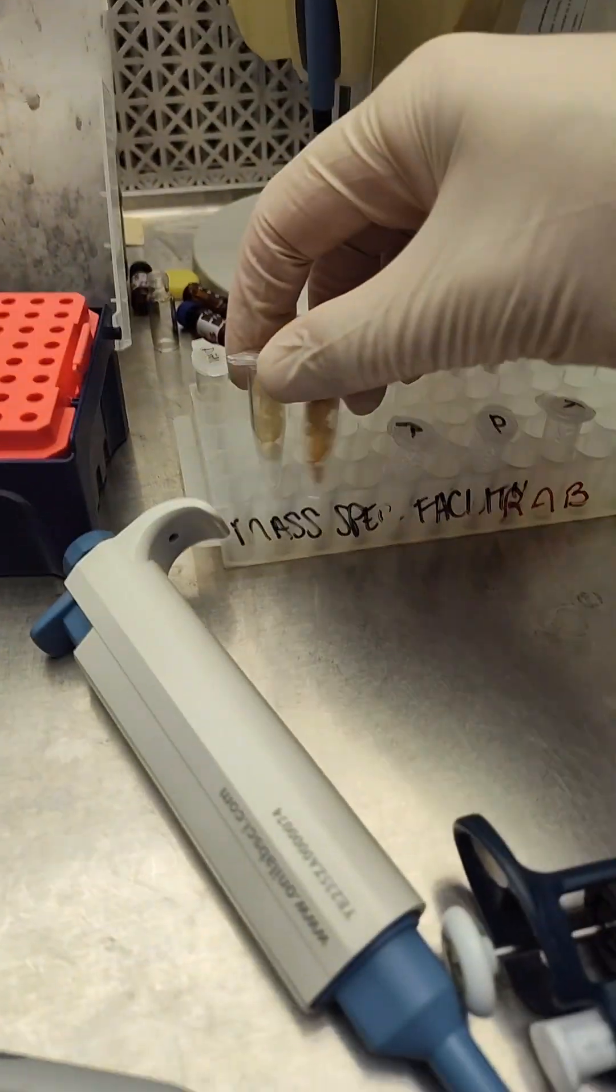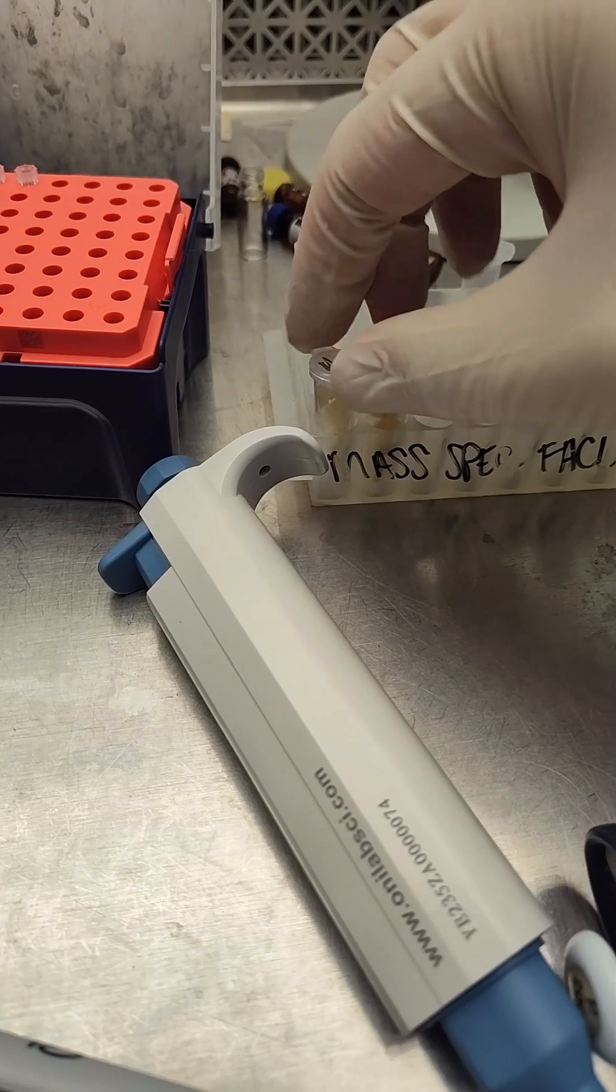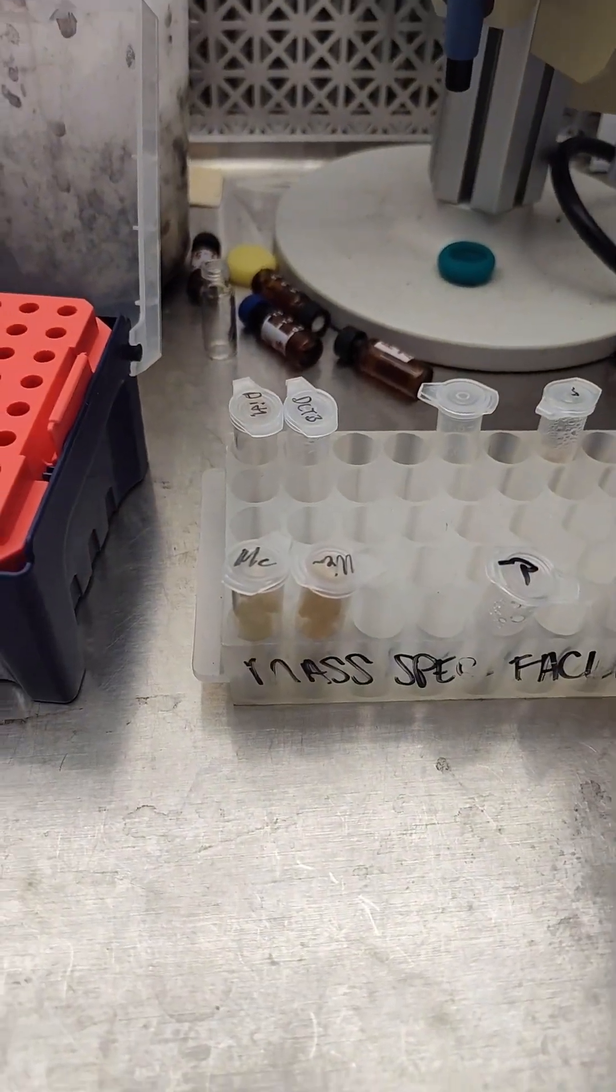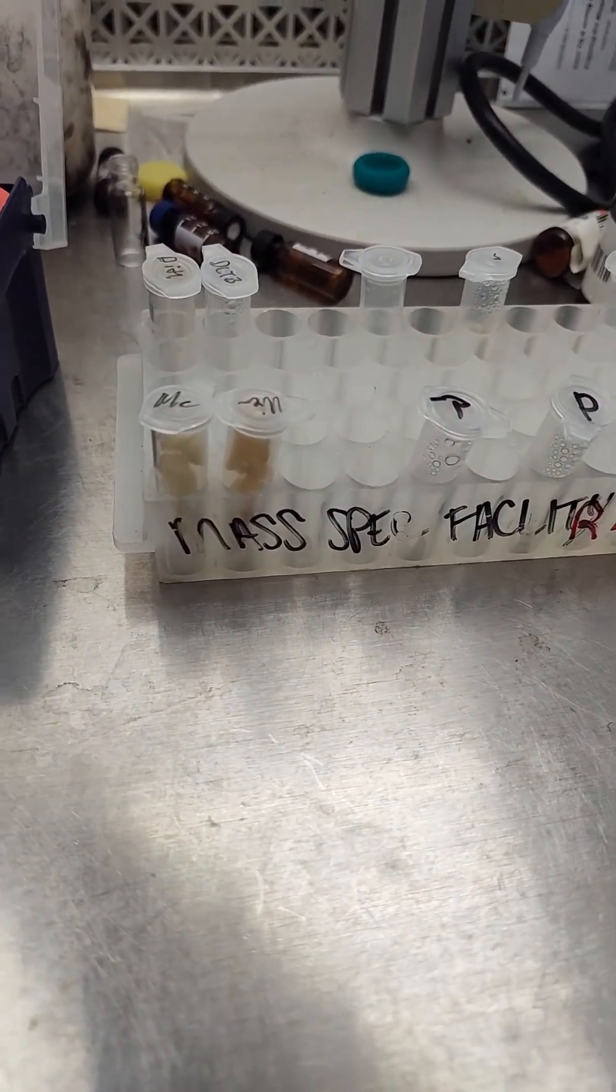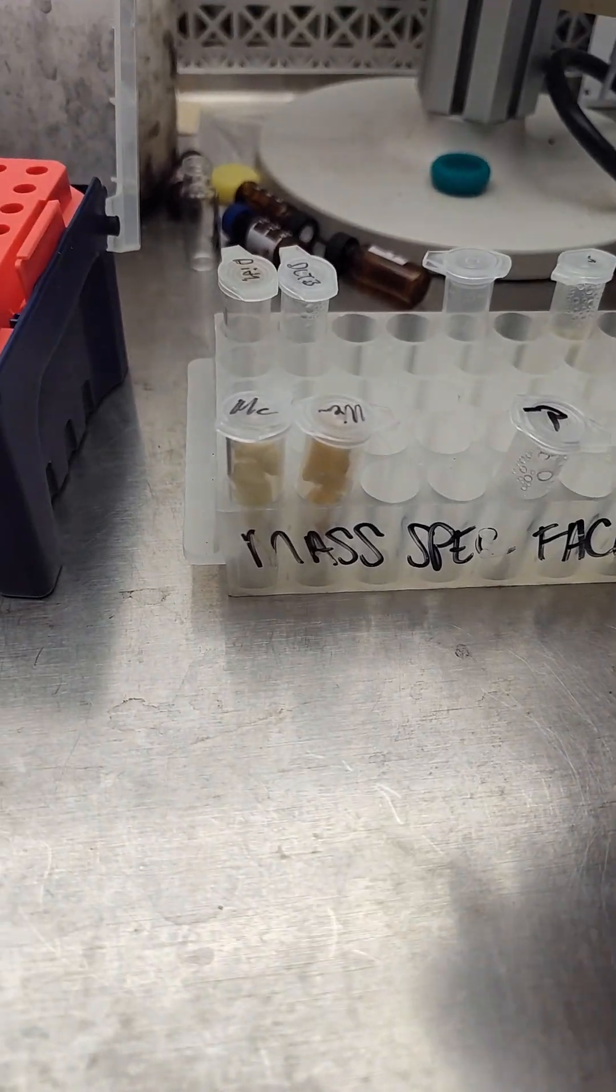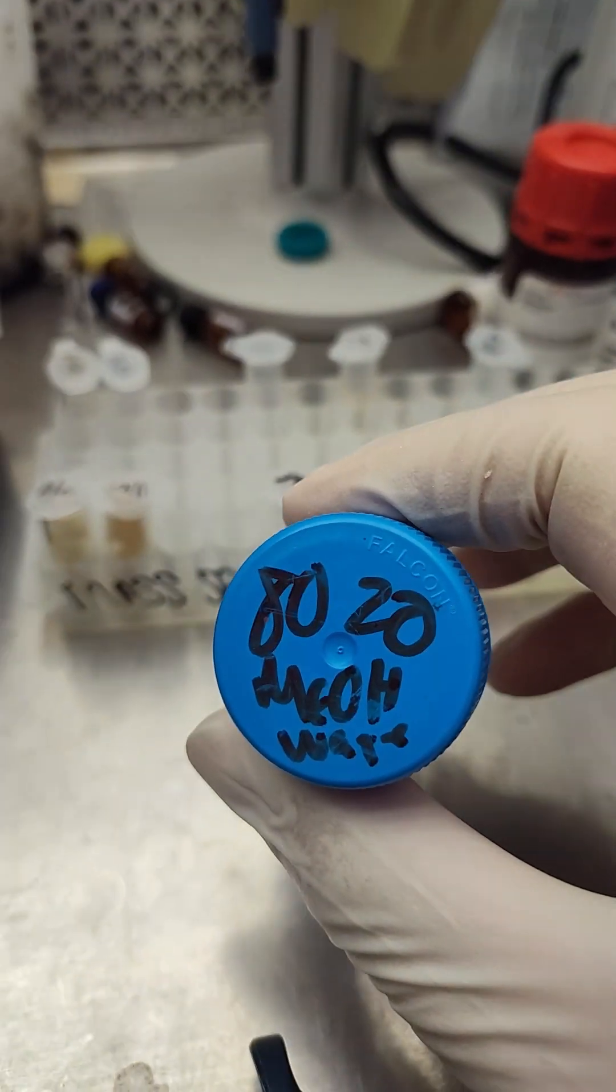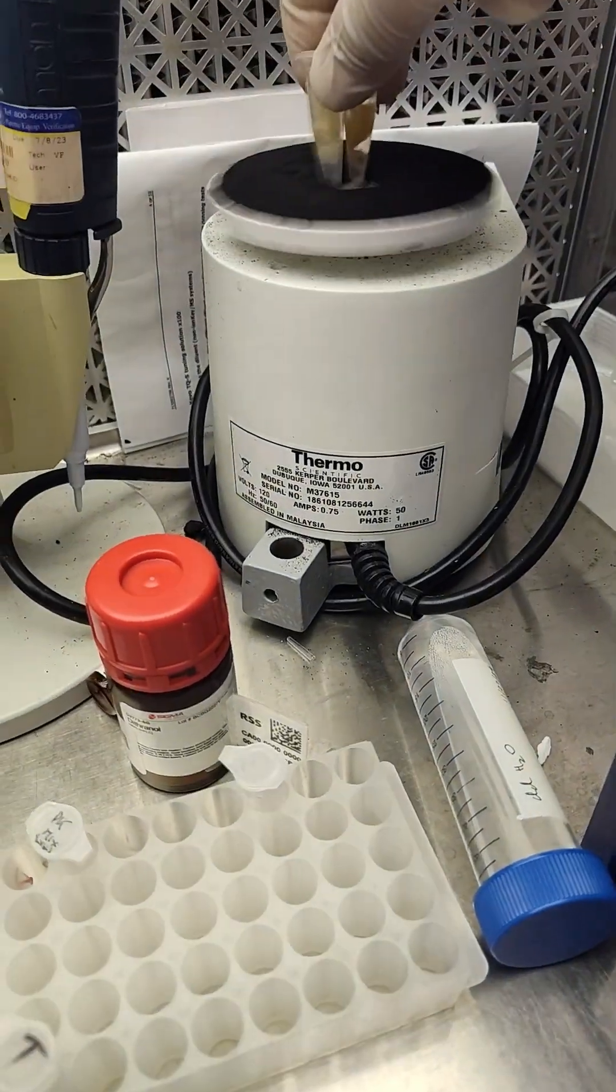Alright we're going to go ahead and add maybe a mil or maybe 800 microliters of this 80-20 methanol water and then we'll sonicate and extract these. Alright in the tubes and we're going to go ahead and vortex these.